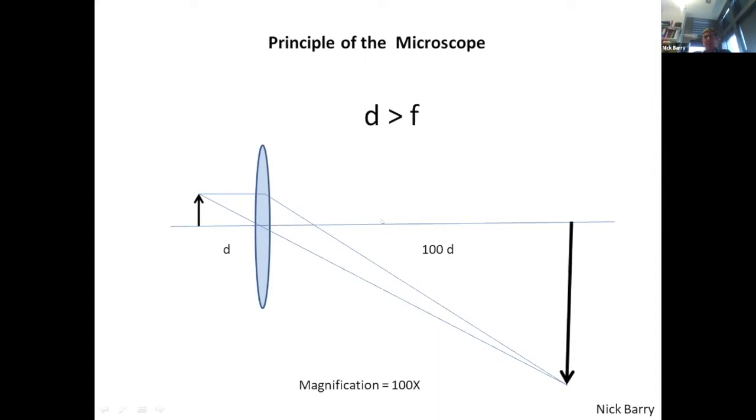But if you take that analogy, you realize that microscopes are not meters in dimension. You don't stick the sample within arm's reach. And likewise, with cell phones, you don't generally see the fine detail. You can't see the individual stitches on the jumper of somebody who's standing in front of it.